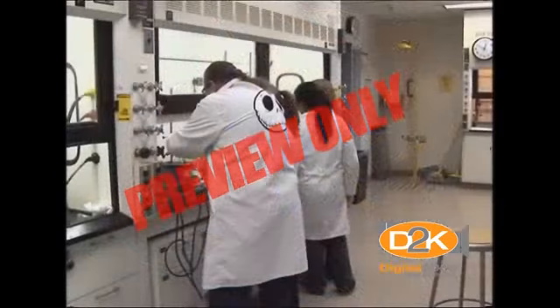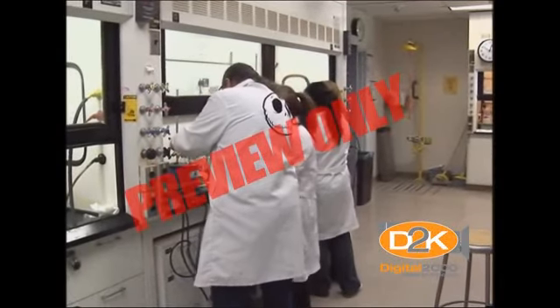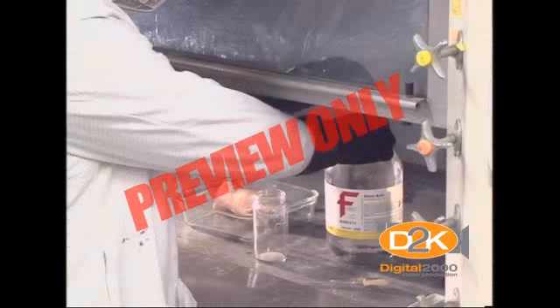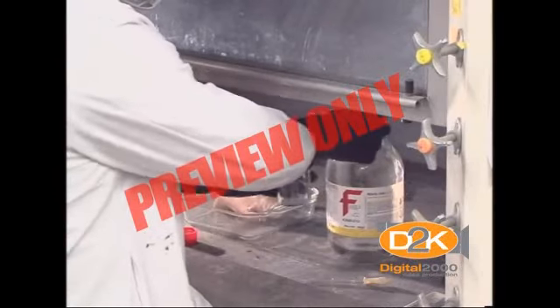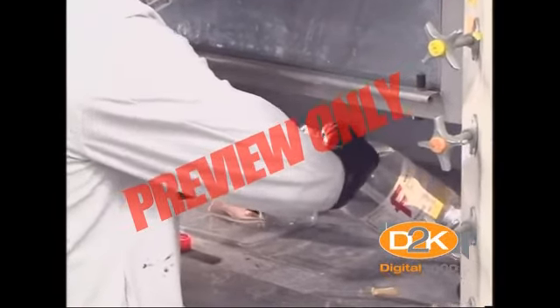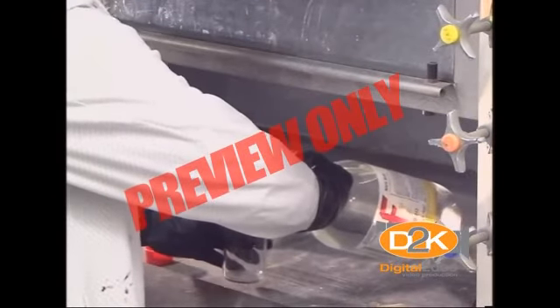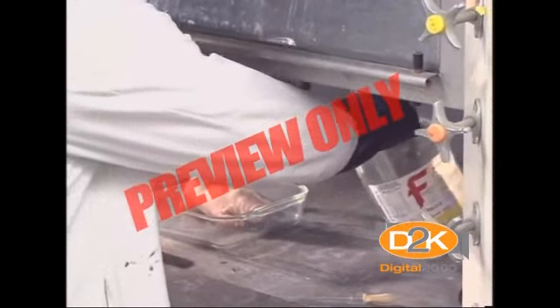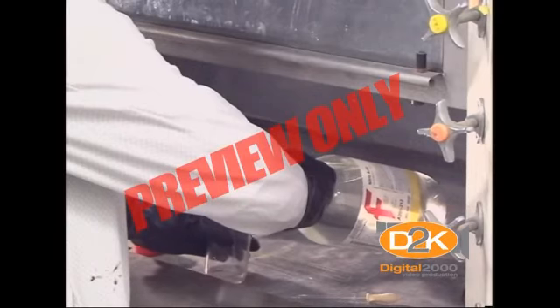Lab coats should cover the entire upper body, extend to the knees, and fit comfortably without hanging too loosely from the arms. Lab aprons are designed to be worn in combination with a lab coat to provide extra protection when pouring corrosive chemicals, using an acid bath, or manipulating chemicals in a manner that increases the likelihood for splashes or spills. Lab aprons should fit comfortably and extend from just below the neck to just above the tops of the feet.